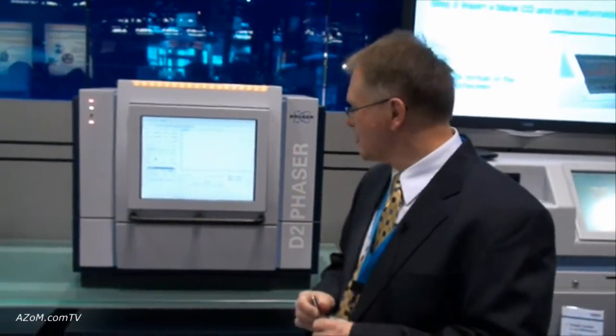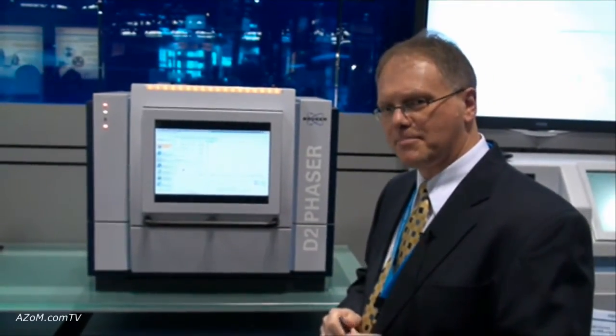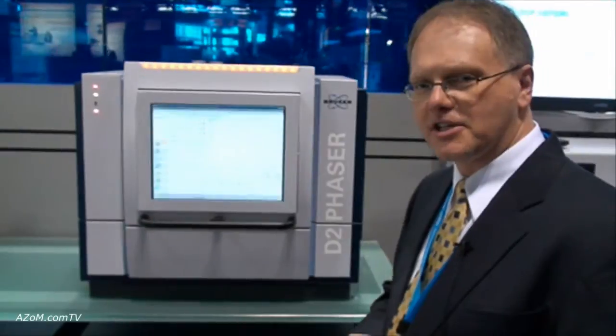Introducing here at the Pittsburgh Conference the new Bruker AXS D2 Phaser. This is a compact benchtop, completely self-contained — except for an external power supply — high-quality, high-precision XRD system.